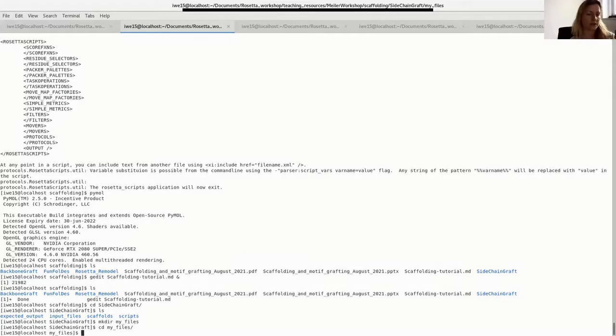So the things we're going to be needing are, as context, the estrogen receptor and, as motif, this peptide. The PDB we are working with is 1GWQ, and there in chain A there's a copy of the estrogen receptor, and the respective binding peptide is chain C.